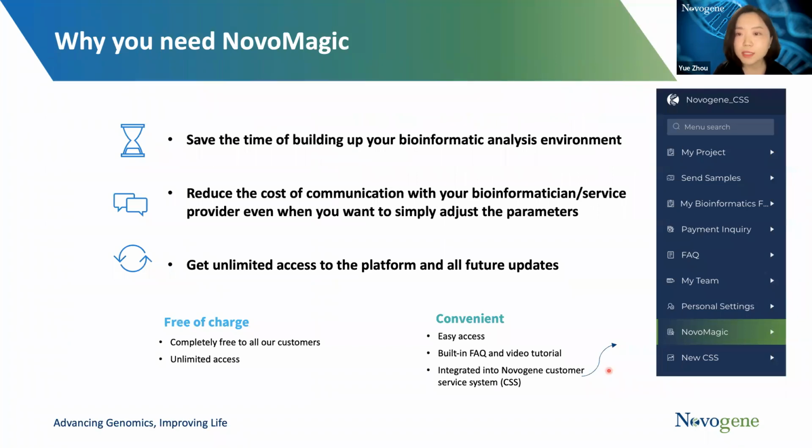There are a series of reasons that NovoMagic might be beneficial for you. It could save the time of building up your bioinformatic analysis environment and also reduce the cost of communication with your bioinformatician or service provider, even when you want to just simply adjust the parameters. And as mentioned, you can get unlimited access to the platform and your project data and all future updates of the platform. Here I'm also showing how NovoMagic is integrated into Novogene's customer service system.